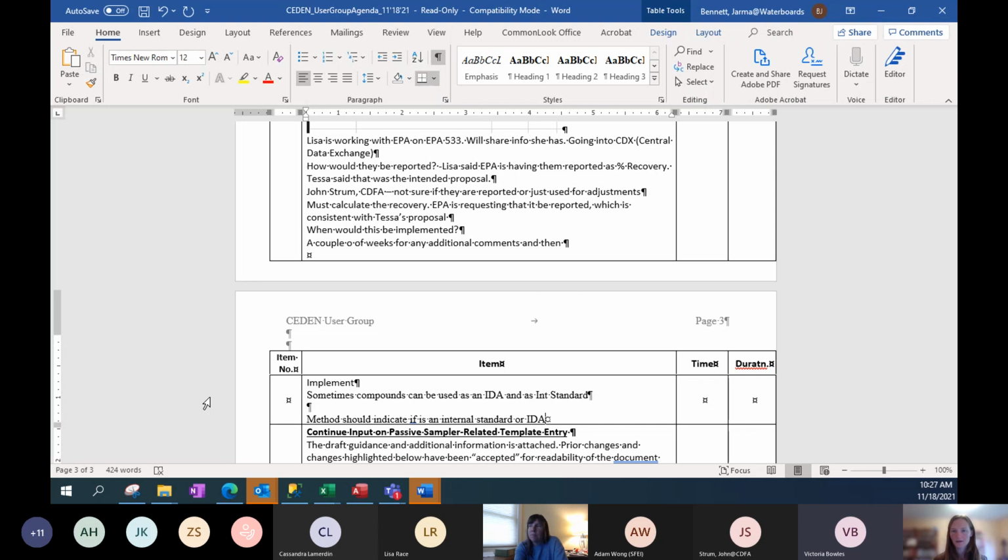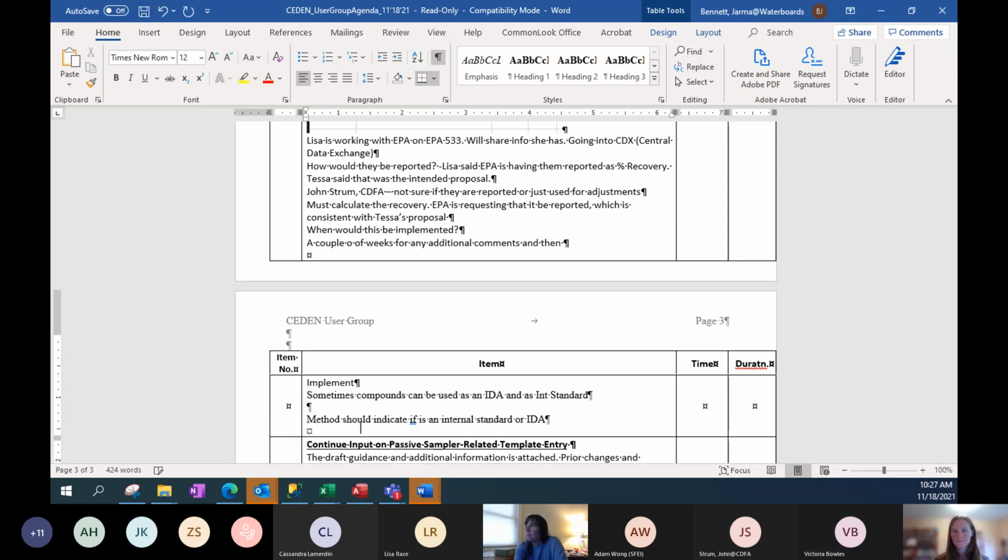Okay, and then Lisa McCrink. Yeah, sorry, my question is kind of along those lines. So couldn't it be that one labeled analyte could play double duty on the quantitation front within the same batch? So you might have maybe 5 different analytes that it's helping quantitate, but only one of them would be its direct analog, right?